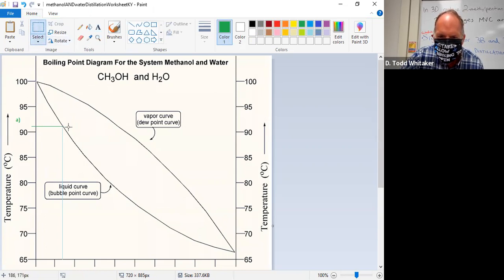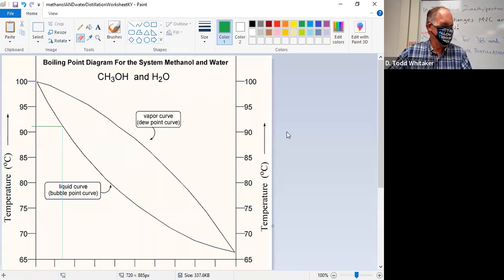I wish I could. I was going to draw 4 more of these, 1, 2, 3, 4, and see if they're evenly spaced. It might be a hair more than 91. Anybody want to take a stab? Yeah, I won't go with the 0.5, but the 0.3 I'll take. I'll take a little higher than 91, but not too much.